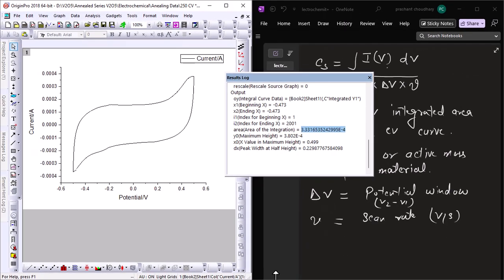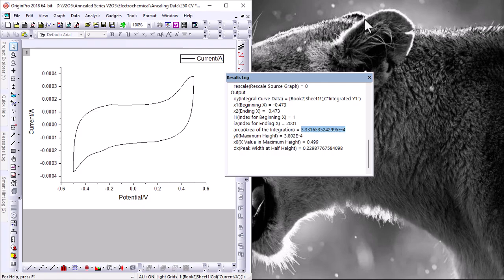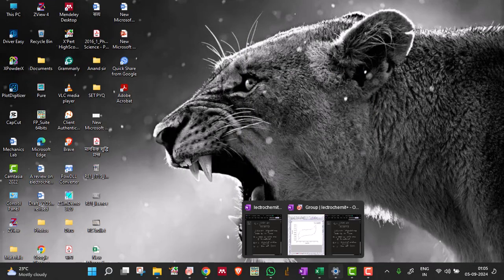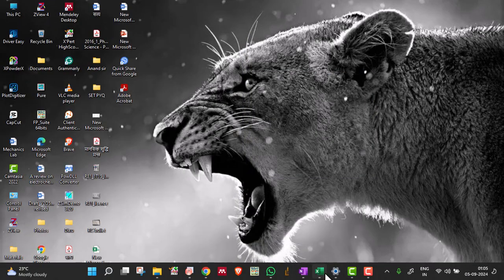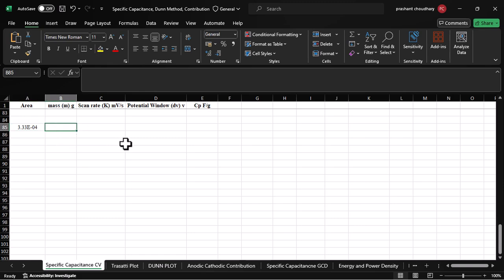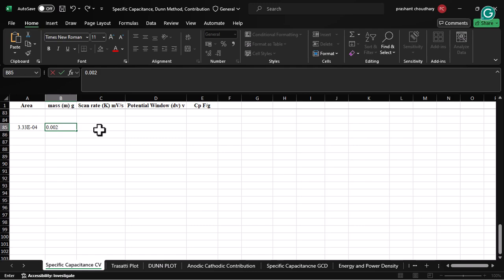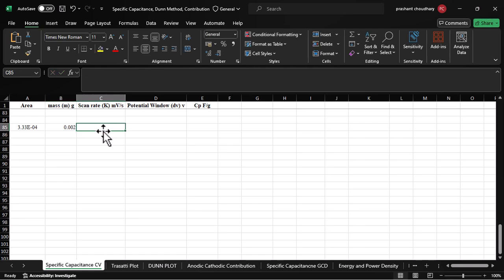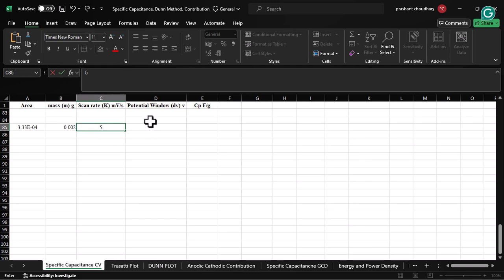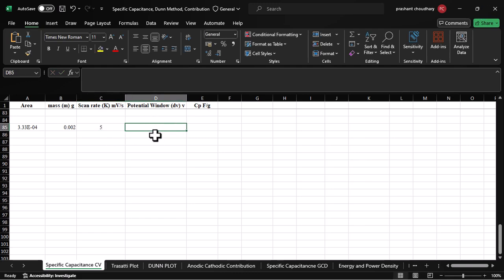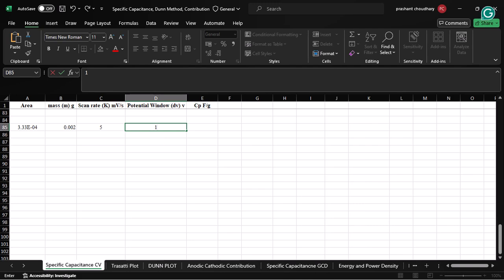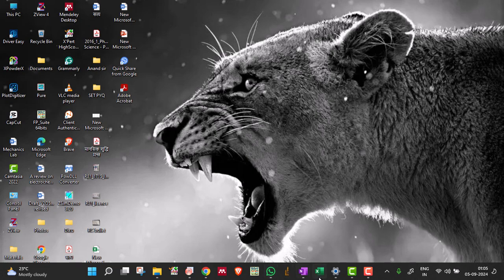I'm going to copy the area of integration, and I've already prepared an Excel file. I'll input the area, mass (we're using 0.002 grams, which is 2 milligrams), scan rate (5 millivolts per second for this CV), and the potential window is 1 volt because we're using -0.5 to +0.5 volts, as you can see in this diagram.